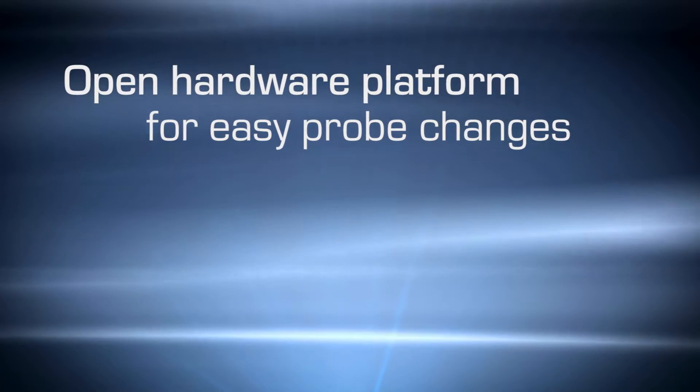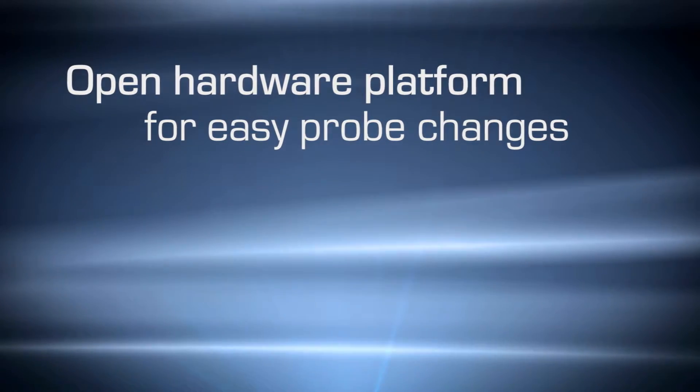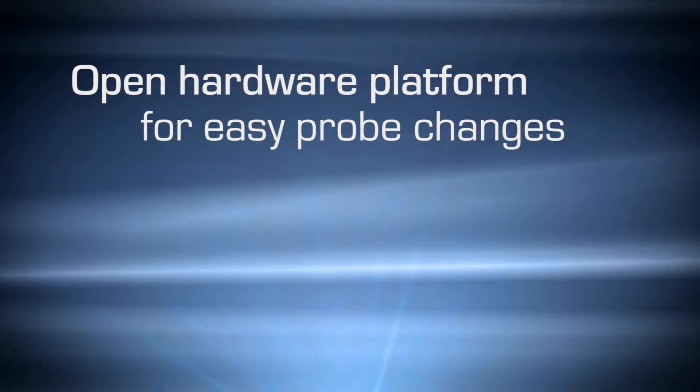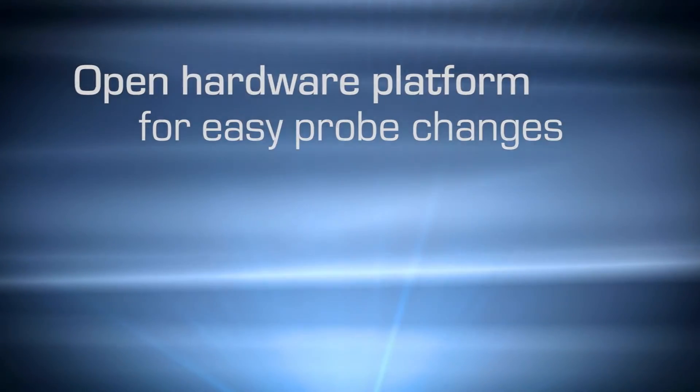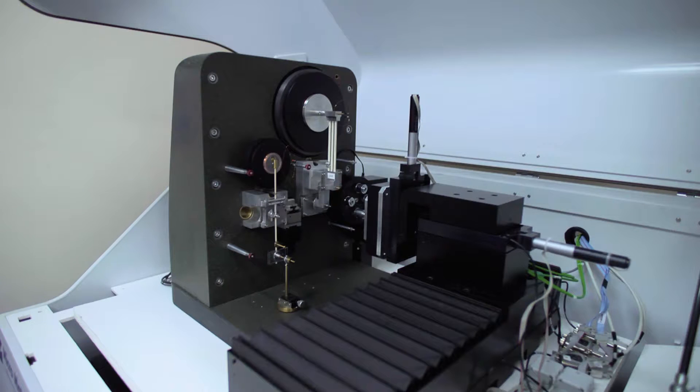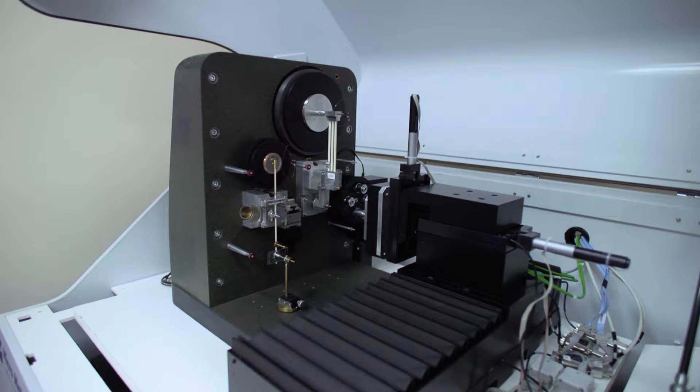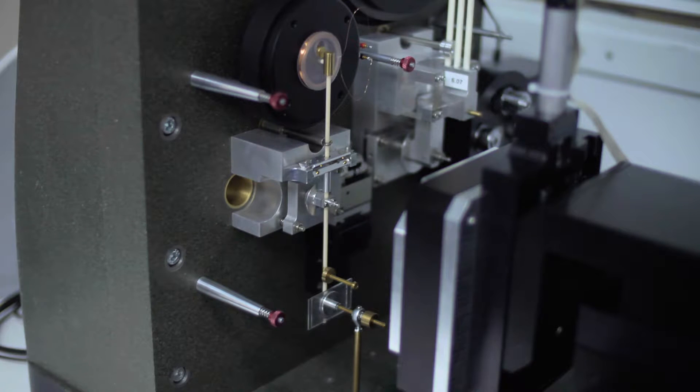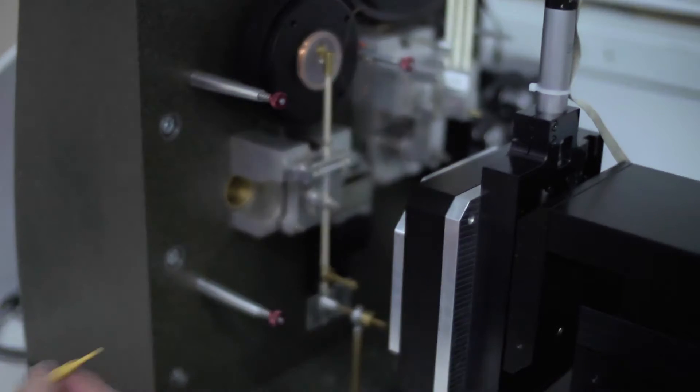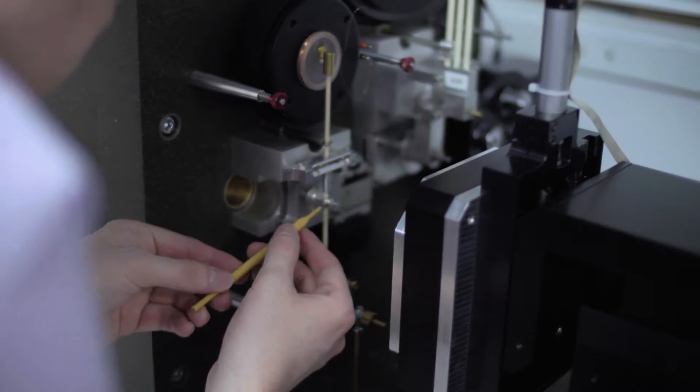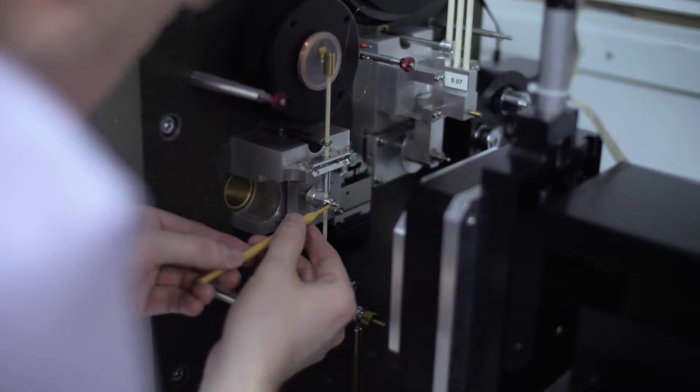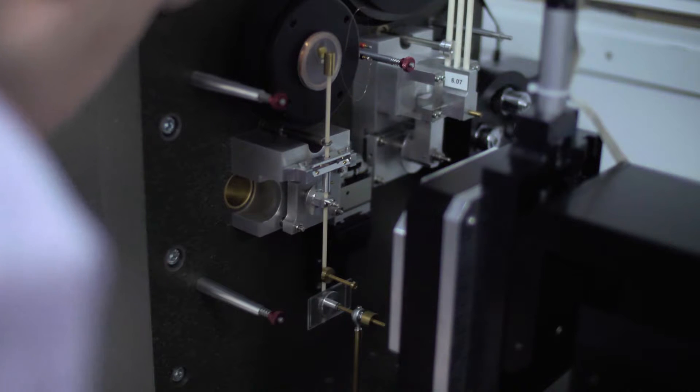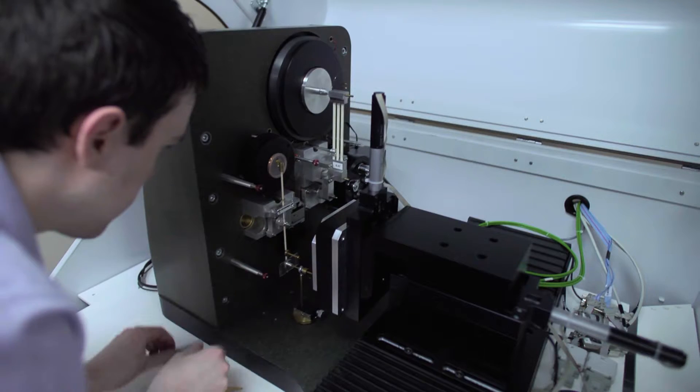One major benefit of the Open Access Horizontal Loading NanoTest system is the ease of changing the indenter. The indenter is held in place with a small screw. To remove the indenter, the screw is loosened and the indenter can easily be removed with a pair of tweezers.